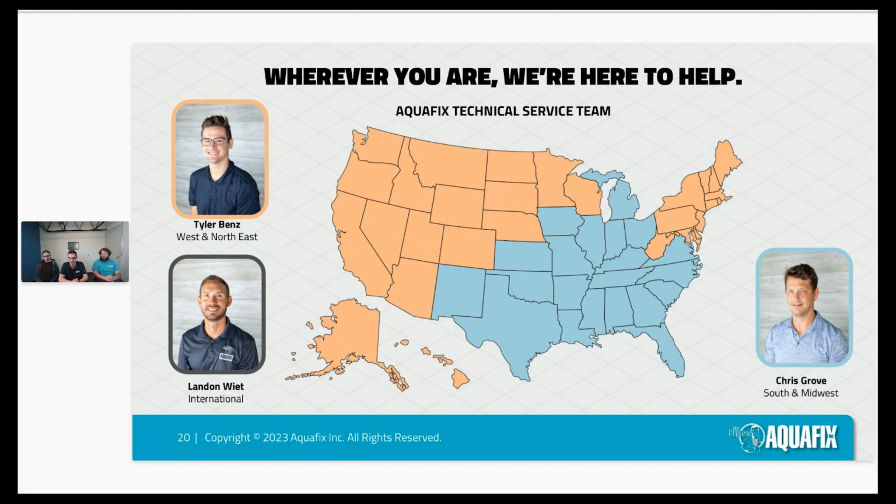Can you touch again on the importance of doing microanalysis when addressing foaming filaments? Yeah. First and foremost, we're going to be able to identify exactly what is the cause. Obviously, it's fats or greases, but what filament are we dealing with in particular? Are we dealing with multiple filaments? We'll be able to identify all of those and prioritize and quantify which ones are in highest abundance and highest priority, or which ones are simply side effects that you don't need to be too cautious about.